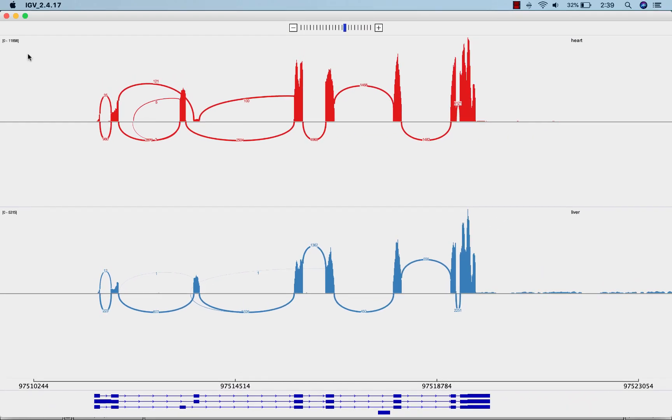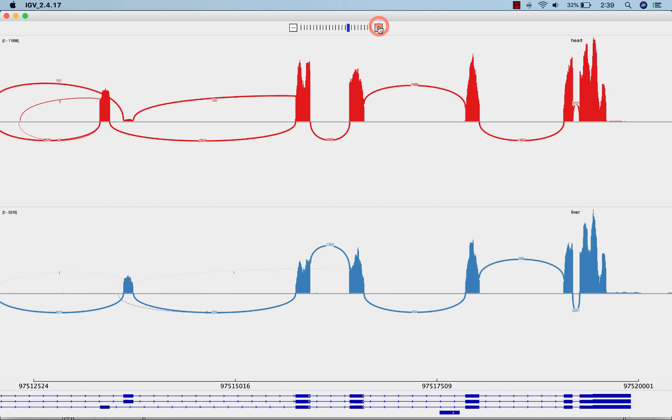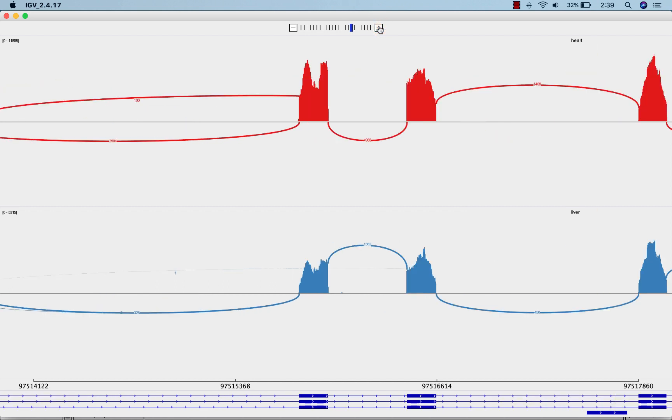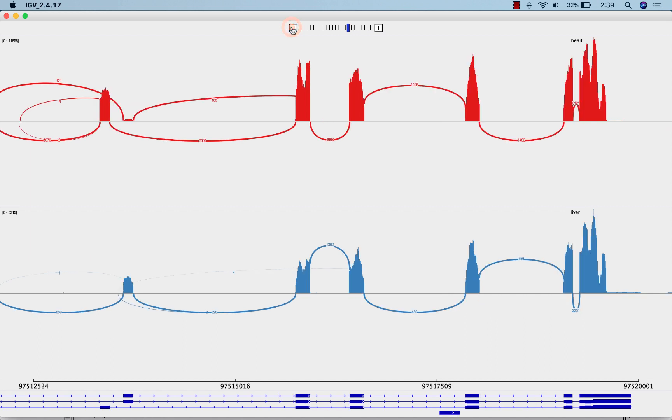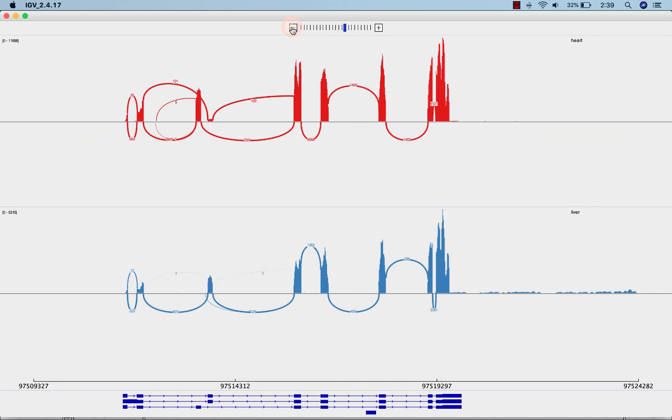In sashimi plots, you can zoom in to see more detail. But you can't zoom out any farther than the zoom level of the IGV window where you initiated the sashimi plot.